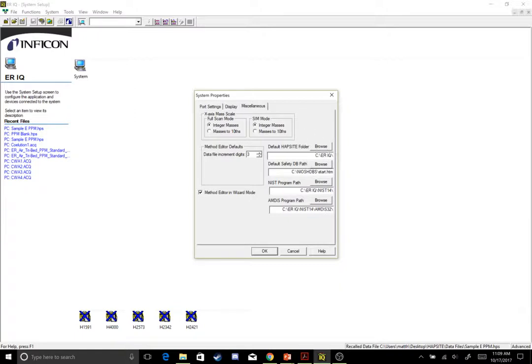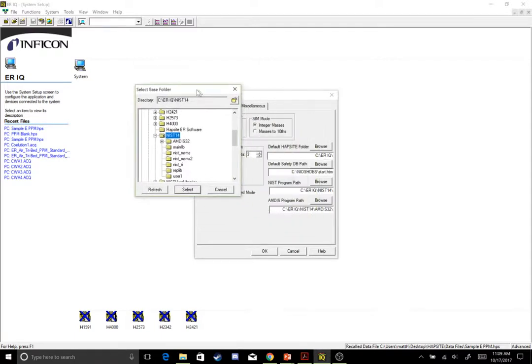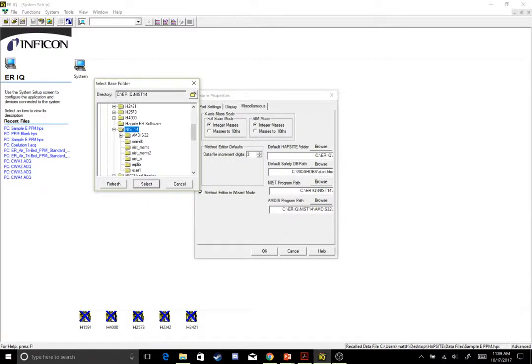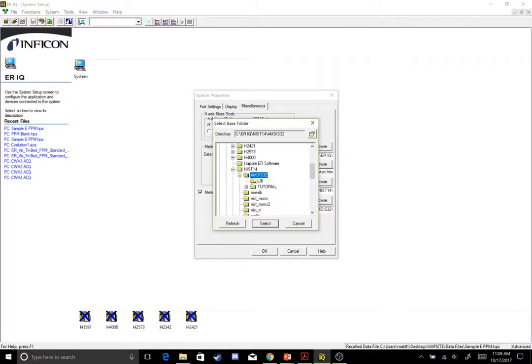The first two are automatically set up when you install the software, but these next two are your NIST program path and your AMDIS program path. That'll be under Browse, see it's ERIQ, NIST 14, so you're selecting the whole folder, and then on the next one for your AMDIS, you're selecting a subset of that same NIST 14 folder, your AMDIS 32 library.